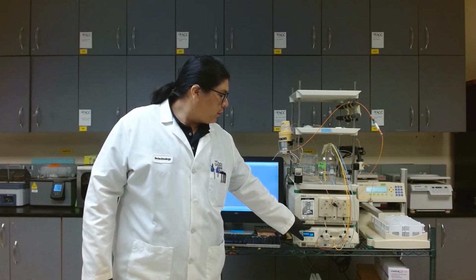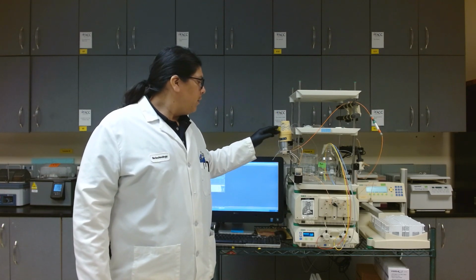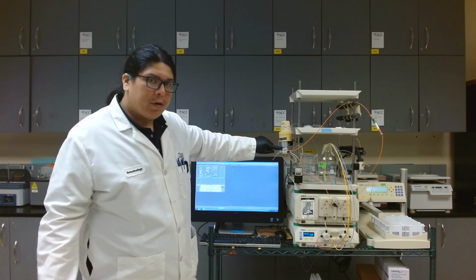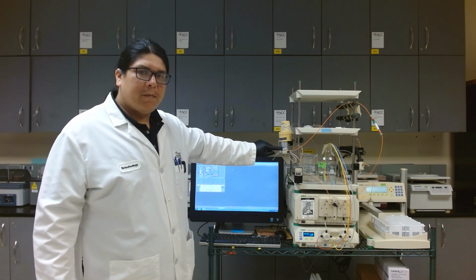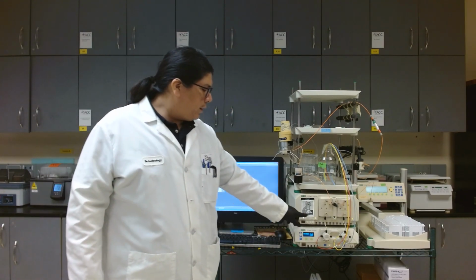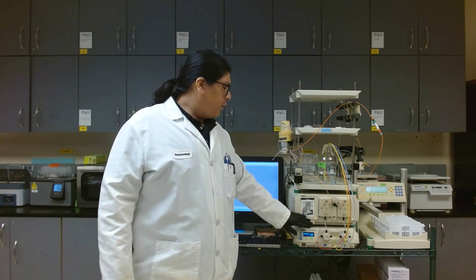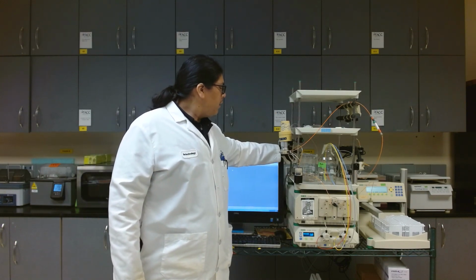So we're going to push those, again, making sure before you do this that the inject valve is in the purge position. And if you're unsure, there's a small window here with the letter P for purge, so you can double check there. Also, you can check in the software, but you can visually confirm here on the module itself. So we're going to push these on, and you'll see that the LEDs for pumps A and B will start blinking, indicating that the pumps are purging. What we want to check for is that there's a steady flow at the waste end, at the waste line.